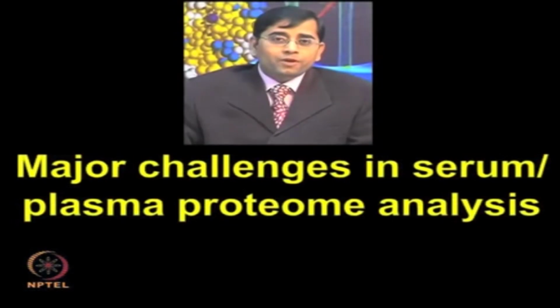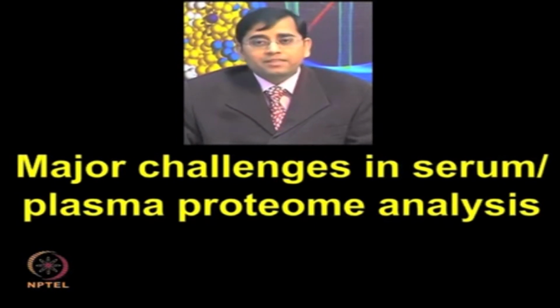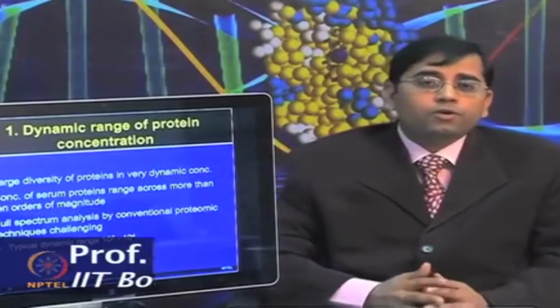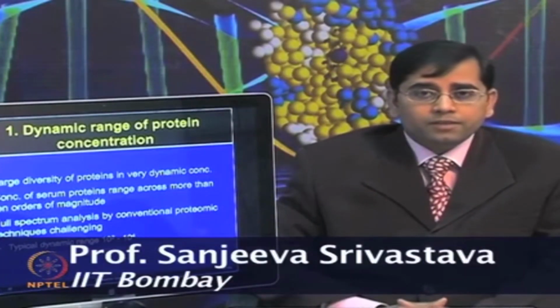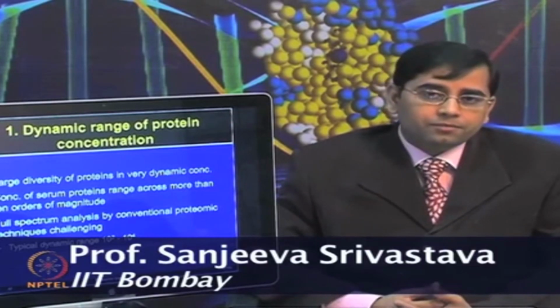Although sample removal is easy, the sample analysis, the serum or plasma proteome analysis, is not so easy. There are major challenges in serum or plasma proteome analysis. Let us talk about some of these challenges point-wise. The first point is the dynamic range of the protein concentration.